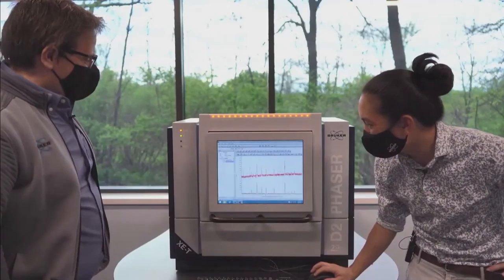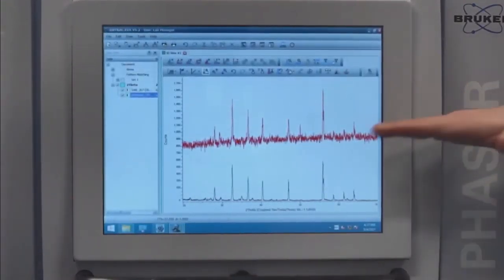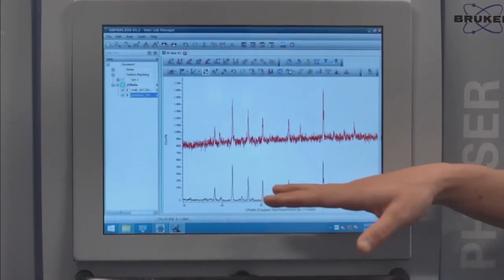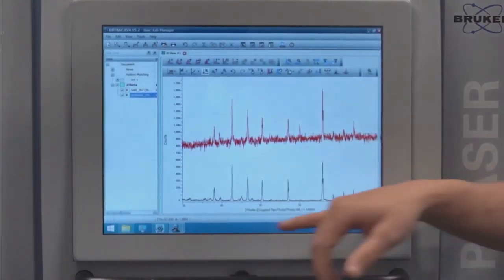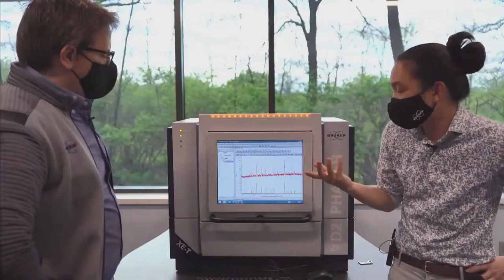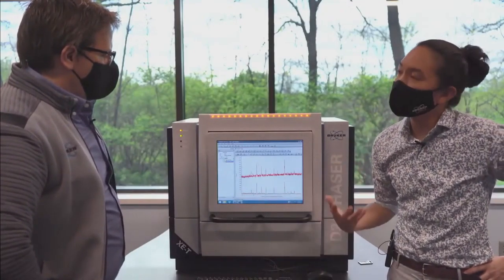But if we do the overlay again, you can see the same thing. Raw data, one minute scans. Yep. This is with the full energy spectrum. So all the sample fluorescence, all of that extra background, all that noise, same counting time, same sample. But that dramatic reduction in background gives you all the sensitivity to these extra corrosion products. This is what happens when you grind a pyrite. It becomes other phases. And we're only able to make that out confidently once you remove your background.